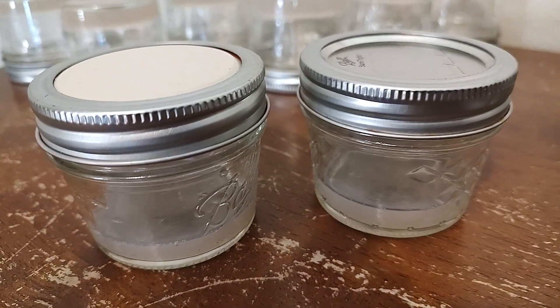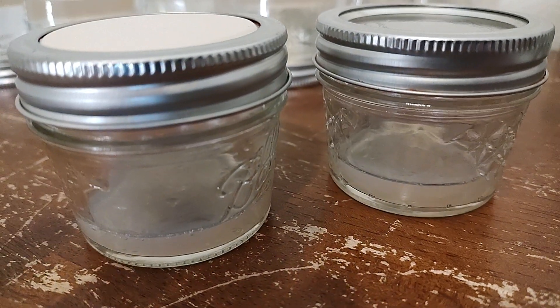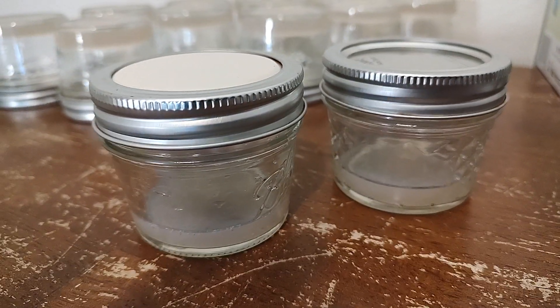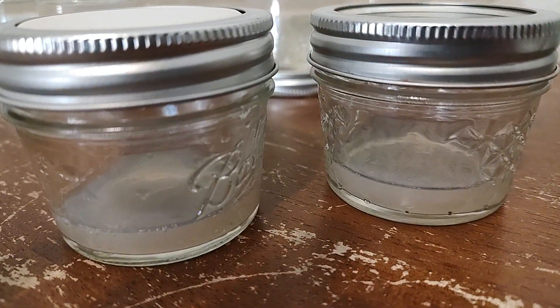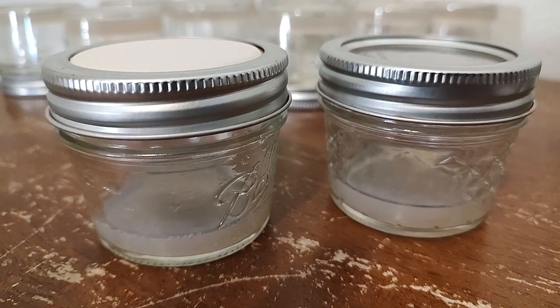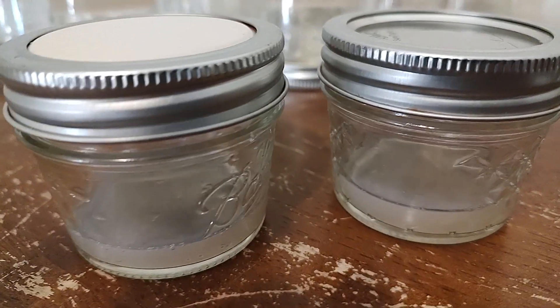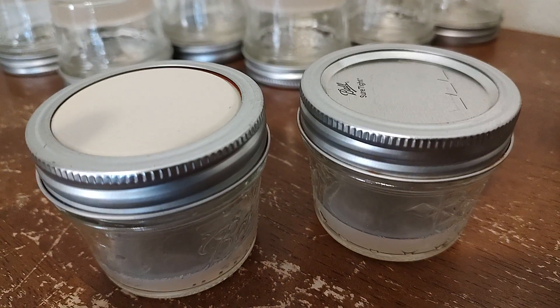Hello friends! The husband has been experimenting with this light MEA agar recipe for cloning gourmet and medicinal mushrooms, and I wanted to share it with you. I'll update you on the results, and I also created a no-pour jar lid video for you.